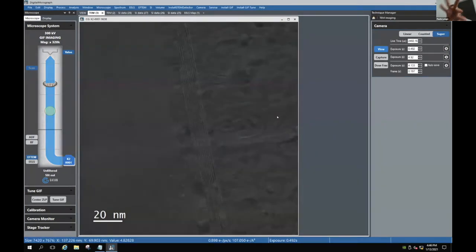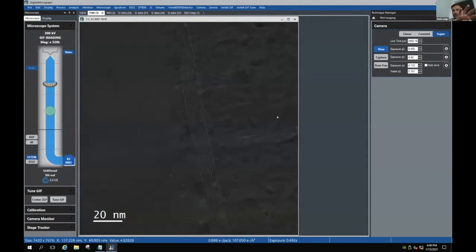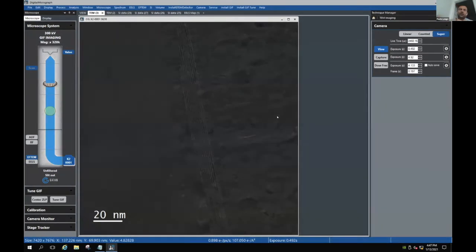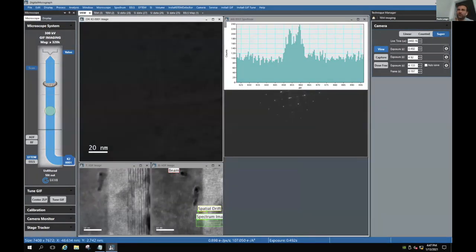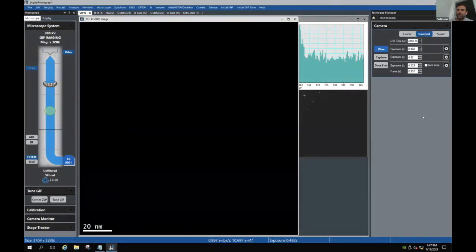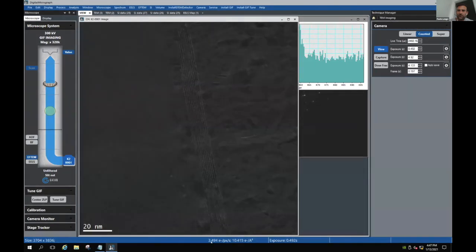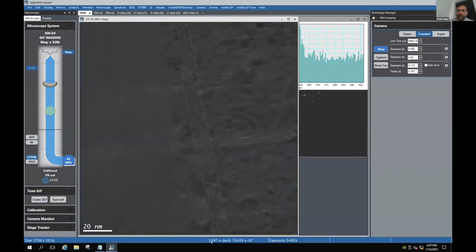With low dose, you have to look at certain aspects. Again, you have to make sure that you know the conditions that you want to use for your experiment beforehand. The camera, as you can see, is very sensitive. It's able to work with essentially no intensity. So actually, Robert, I just want, as a proof of concept, can you reduce the intensity to even below 1 electron per second per pixel? To show the extremely low dose condition, the camera will work, but you're going the other way.